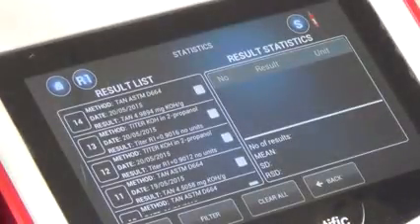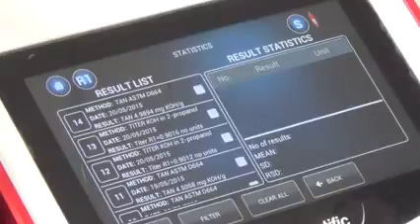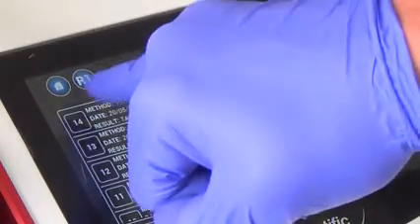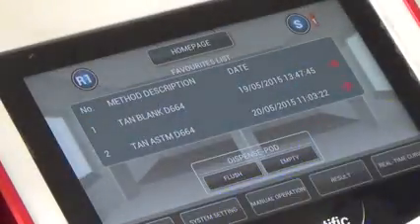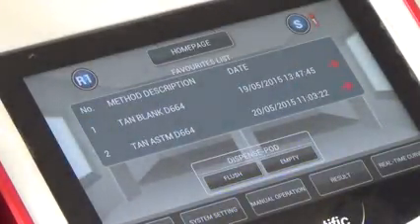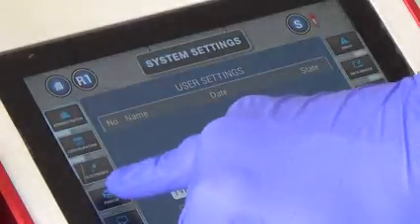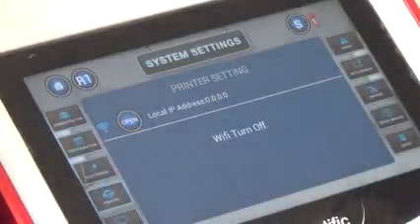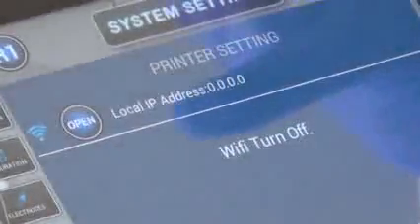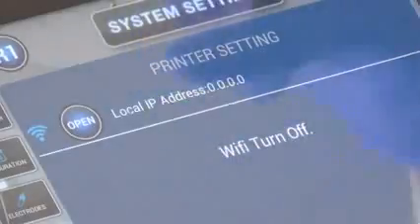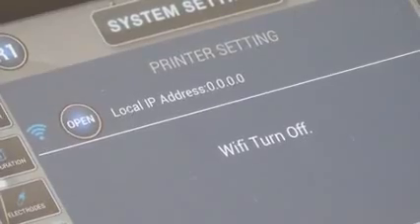The other option we do have as well is WiFi printing. So this is very important, depending on where your PAT Smart Titrator might be placed in the lab. You might not always be near a printer. You can access this through system settings. If you see a printer here, as you can see, at the moment the WiFi is turned off. But when this is on, it would list all the local addresses, and you can open one, select, and straight away you can print.